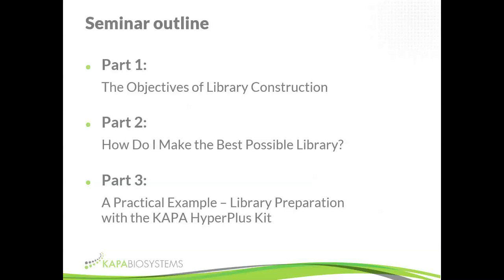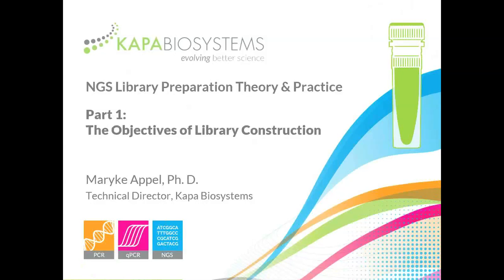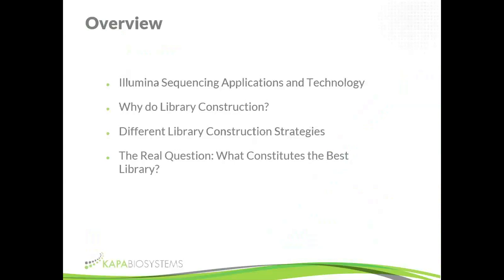getting right into it. And so switching straight into part one, what we'll cover in here is a very, very high level overview of Illumina sequencing and applications and technology. This is not trying to be an explanation of Illumina sequencing technology. There's a lot of good information on the internet about how it really works. And I believe that you guys will also have an Illumina dedicated seminar later in the series. But it's just to provide enough context for what follows.